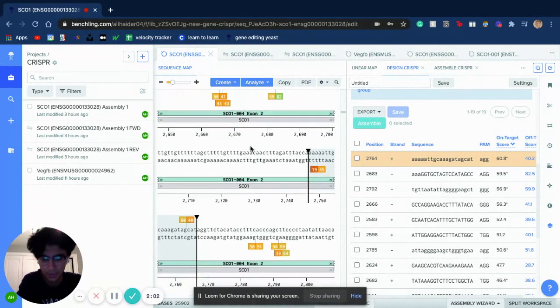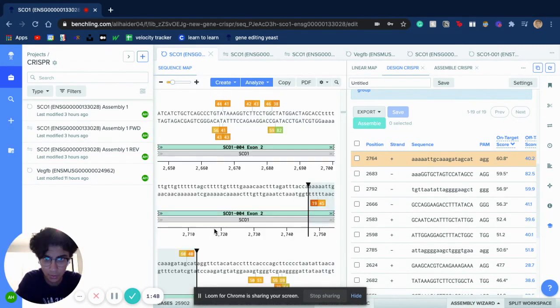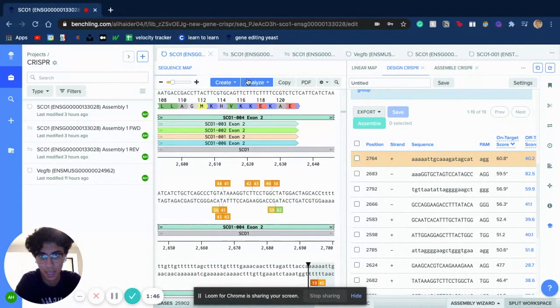If we were to take a single guide RNA from this area, it's not going to affect how this DNA can actually produce proteins, which is called the process of transcription. So it was important that we choose something that actually touches on this area where the transcripts are located.